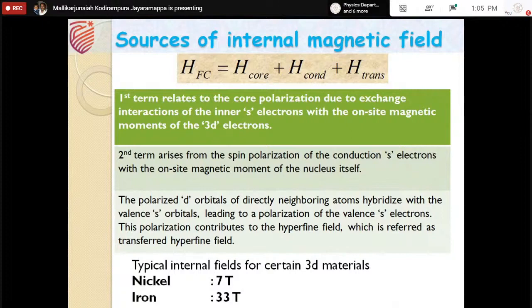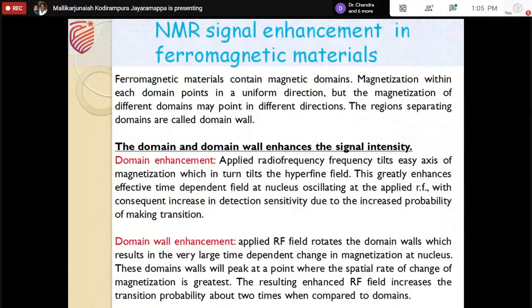The only advantage here is we don't need a very expensive superconducting magnet to perform these experiments. But the disadvantage is that we should be strong enough in the electronics to fine-tune our spectrometer to match this particular magnetic field, that is to say, in terms of frequency.